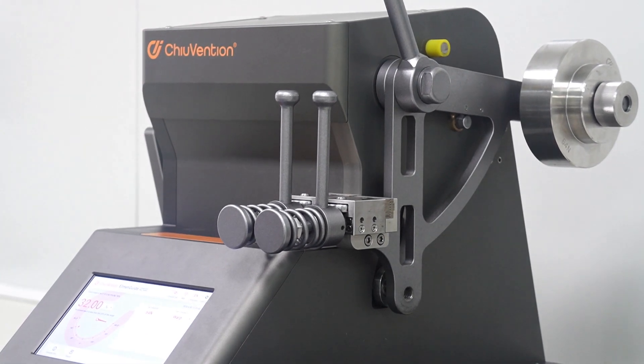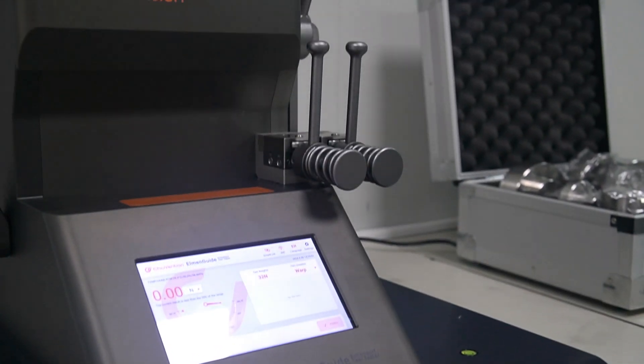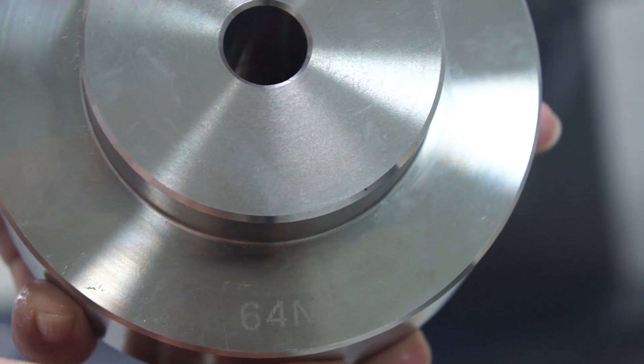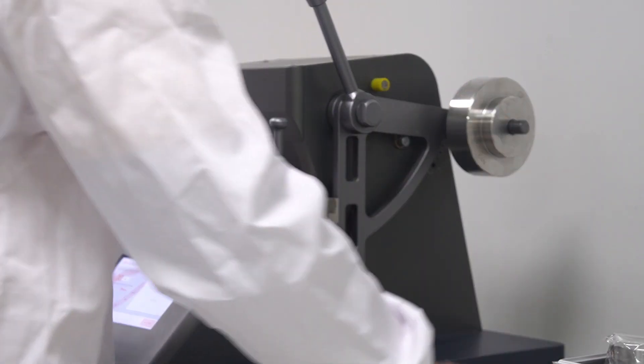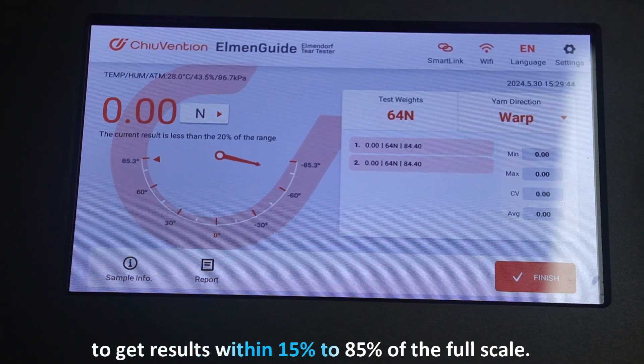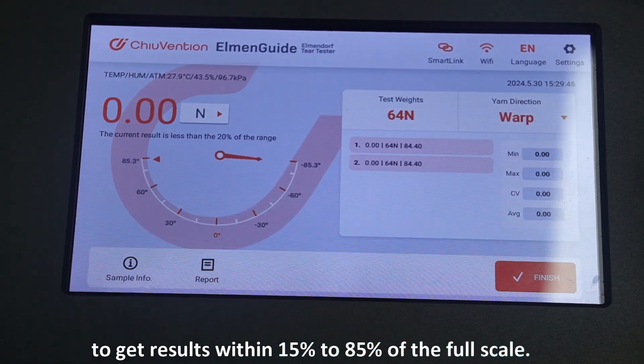Now we're ready to test. We place the tear strength tester on a sturdy table and set it to zero. We also check the weights to make sure they're calibrated correctly. We select the right weight for our samples to get results within 15% to 85% of the full scale.